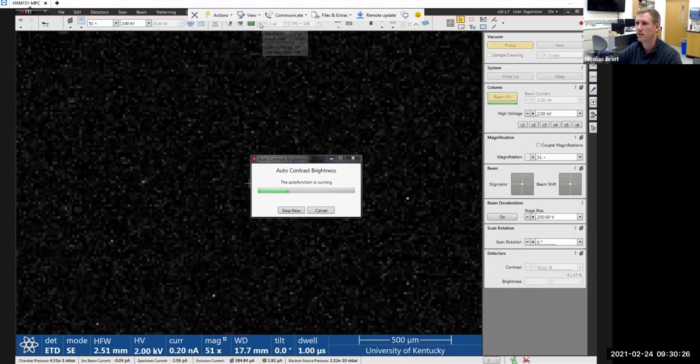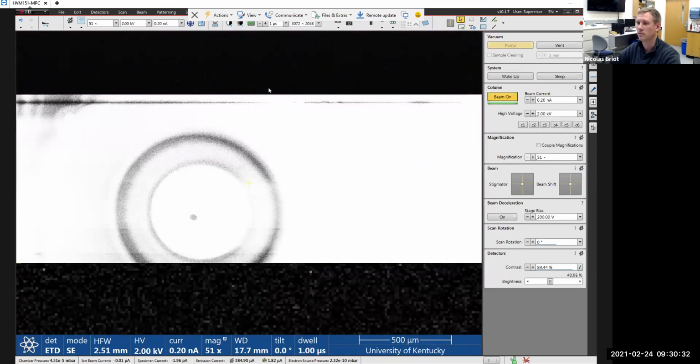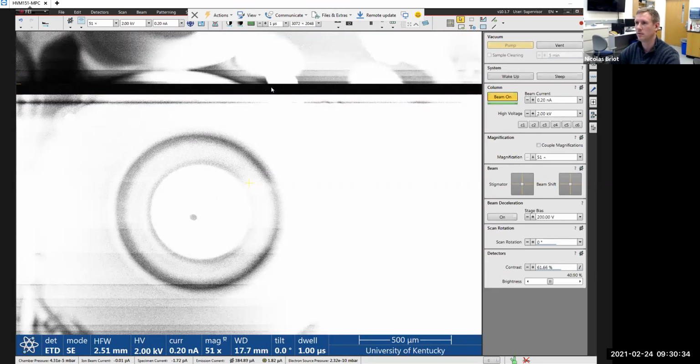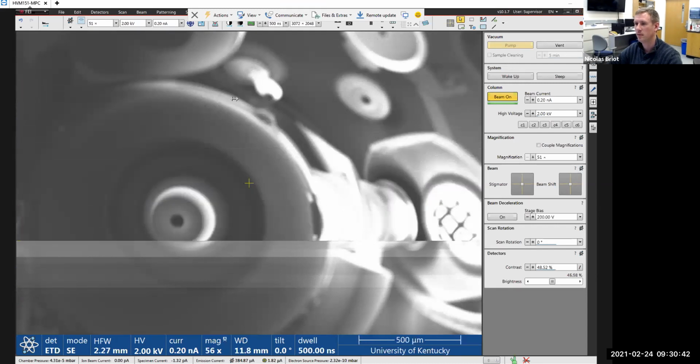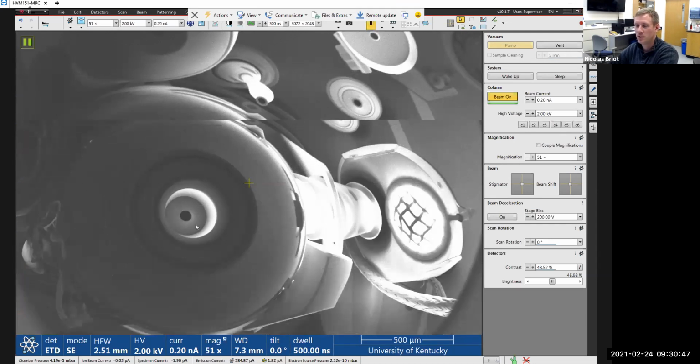See if it... Here we go. All right. So for an insulator like we have now, I loaded so many electrons in there that the surface became negatively charged. And as I reduce the energy of the electrons, they don't have a lot of energy, obviously, just 2 kilo electron volts of energy.